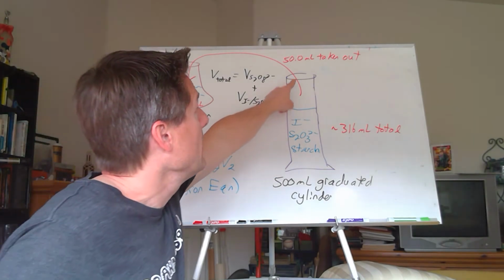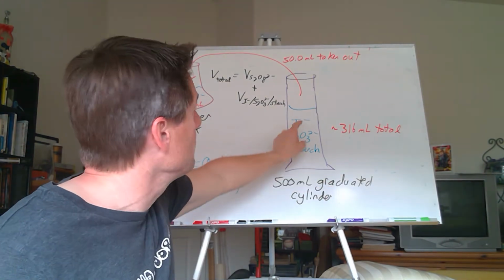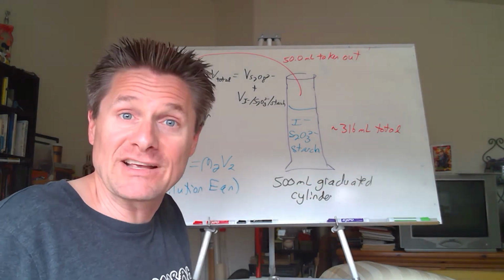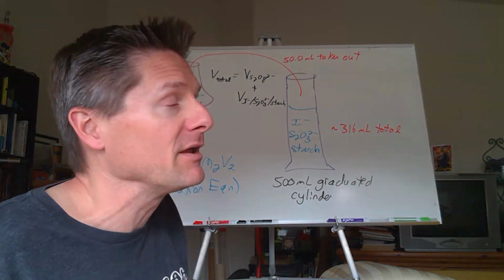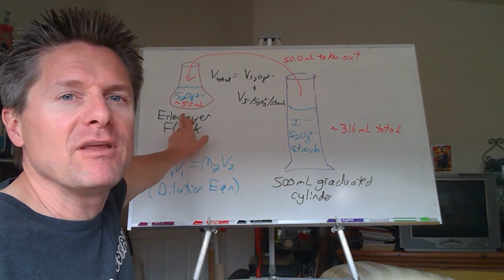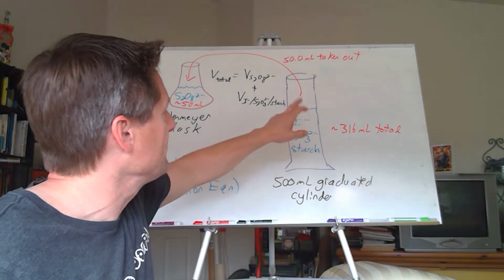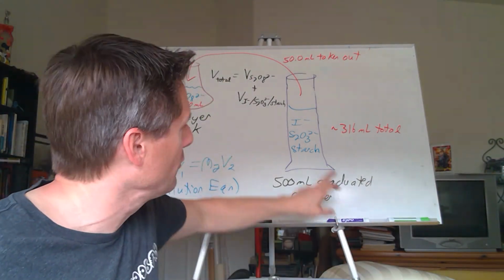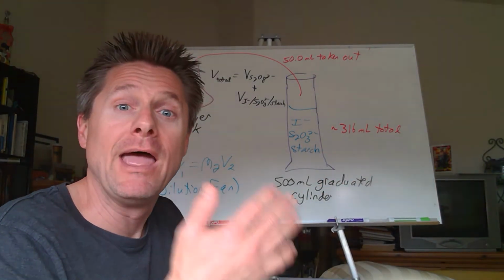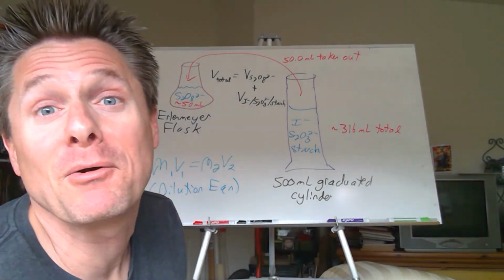Then we're going to take 50.0 milliliters of this iodide starch thiosulfate solution and add it to each of the 6 flasks. That's why we have a little over 300 milliliters here: 6 flasks times 50 mLs. So we're going to line up these 6 Erlenmeyer flasks of different concentrations and go boom, 50.0 milliliters of this into the first flask, boom, 50.0 milliliters into the second flask, boom, into the third flask, fourth, fifth, sixth flask, swirl them, boom, that's time 0, and pick our nose until they turn blue. Hey, that's the final time, and you're done. That's all the experiment really is.